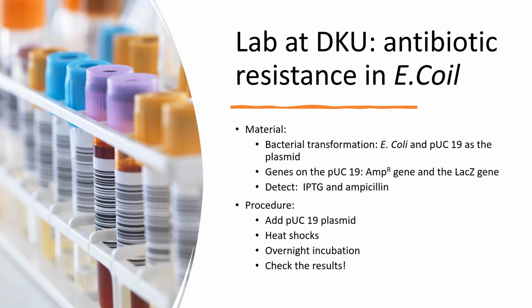In our lab, we first added pUC19 plasmid into the tube containing E. coli. We then gave the E. coli a heat shock to trigger the transformation process. After overnight incubation, we checked our experiment results.